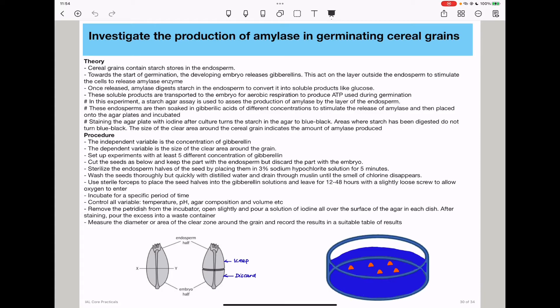Staining the agar plate with iodine after culture turns the starch blue-black. Areas where starch has been digested do not turn blue-black. The size of the clear area around the cereal grain indicates the amount of amylase produced.